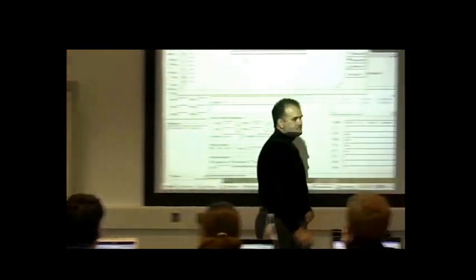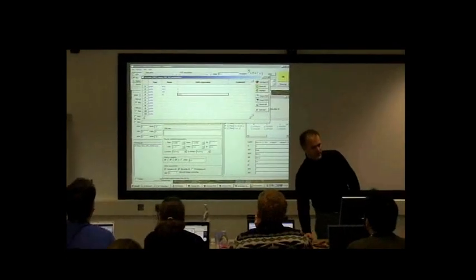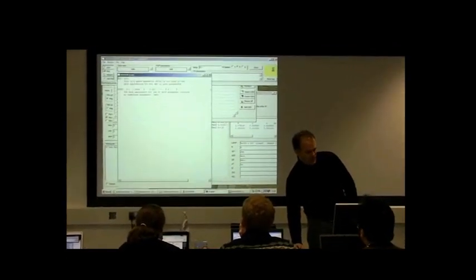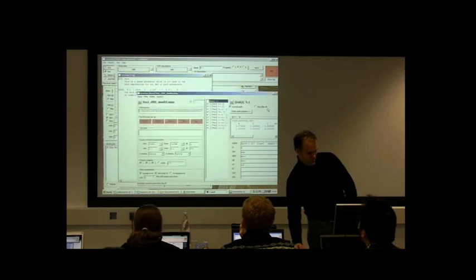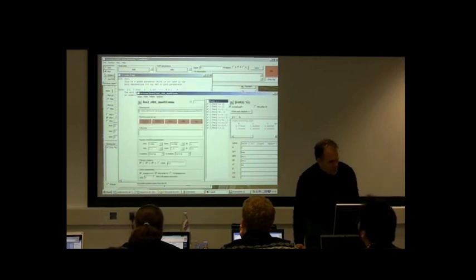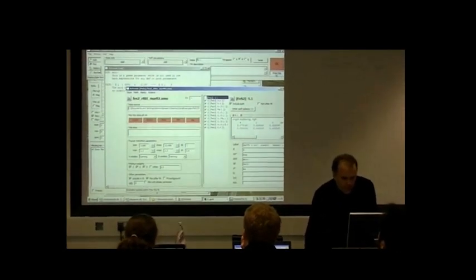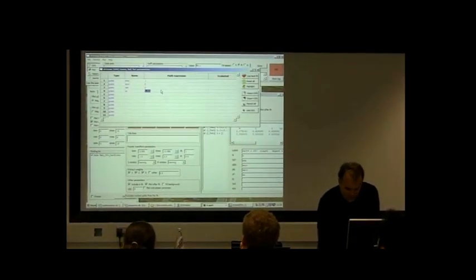So, it turns out I'm now ready to hit the big green fit button, and so I'm just going to go, so, E naught. Oh, I know what the problem there is. I did not hit carriage return to finish this. There. Now I've defined it. You have to actually hit carriage return to get it to take.